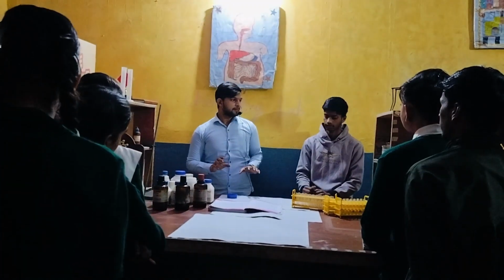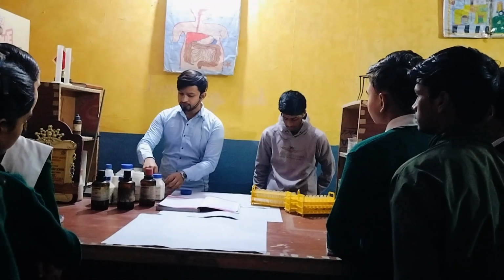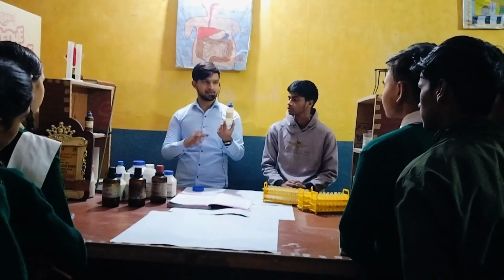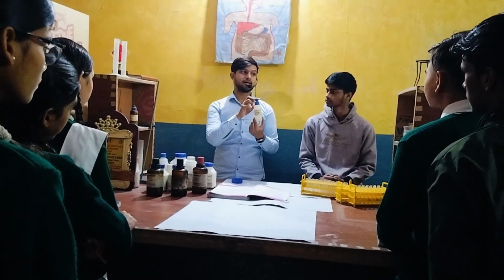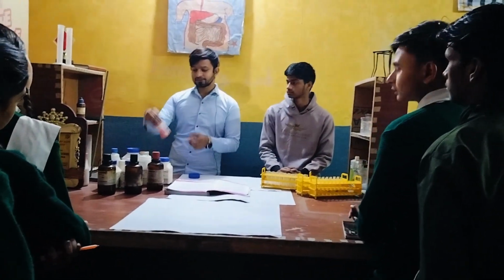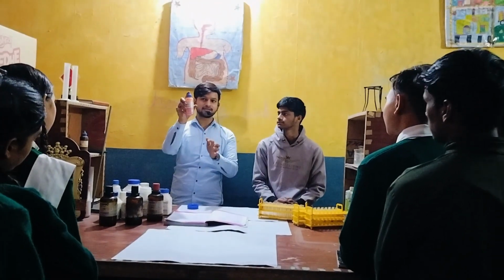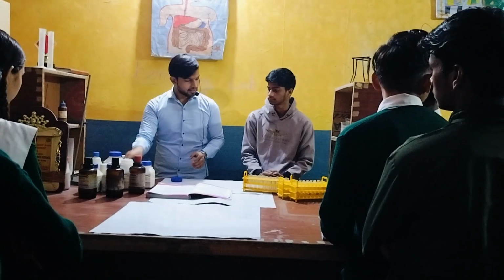Next, for the acid and base chapter reactions, we have phenolphthalein. This is phenolphthalein, I hope you have studied about it. This is a chemical indicator, because it is generated in the lab. And this is methyl orange. You can see the color of this bottle is orange. We will perform the experiment and learn more about it.